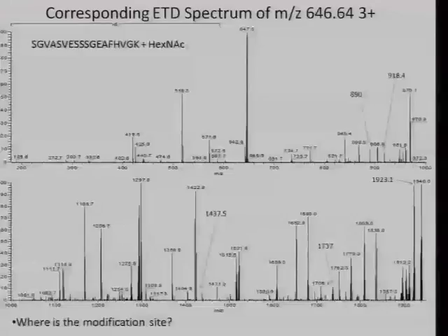No, it doesn't tell you a great deal. I mean, amino acids are not homogeneous, and so cleavage N-terminal or C-terminal to certain amino acids is easier than others, and so the intensity is in some way related to the amino acid sequence, but it's very difficult to predict.